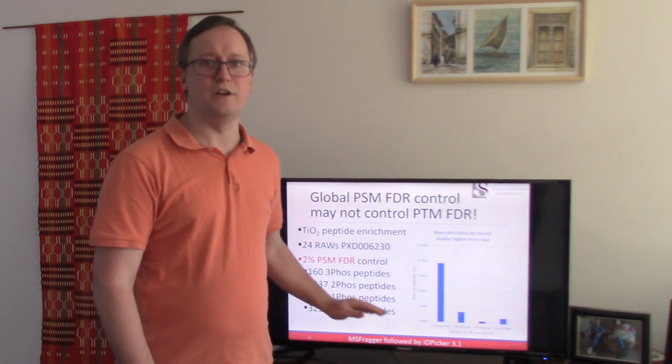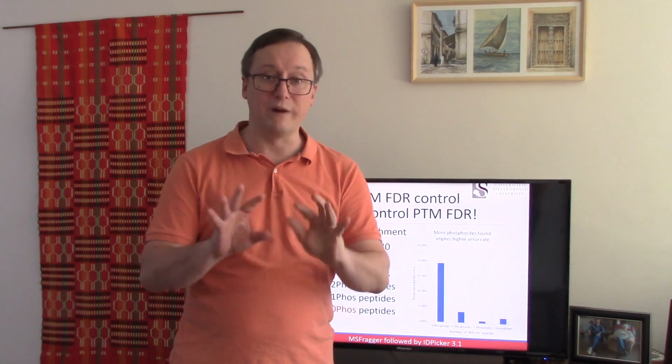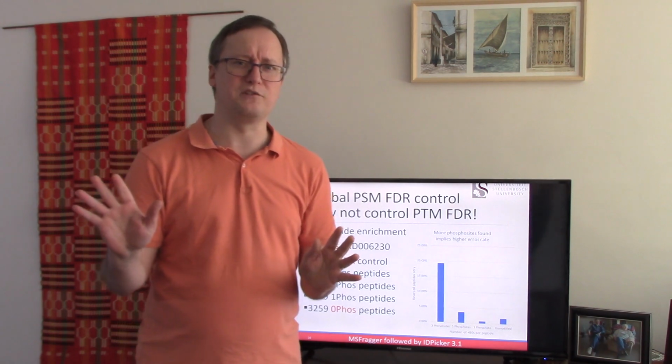Next, I want to note that the more phosphorylations that the software was allowed to put onto the peptide sequence, the greater the error rate. This might not seem sensible. We applied a 2% overall PSM false discovery rate.